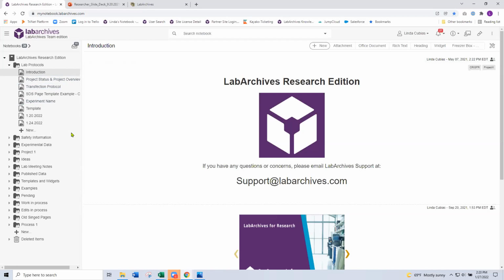First up, of course, the obvious point is the structure of the notebook, on the left-hand side of the page. It's hierarchical in structure, meaning you've got the name of the notebook. Within that reside folders. You can also have subfolders. Then you have your pages. What a page looks like, you're in control of. Everybody's going to have a different interpretation of what a good page looks like. It depends on the data you're working with. Here's one of my sample pages.